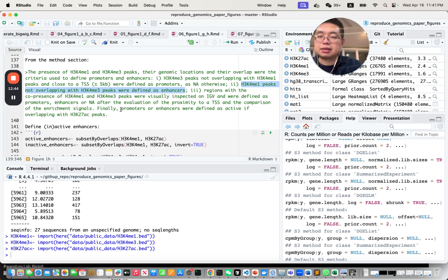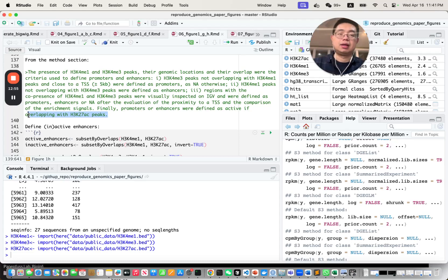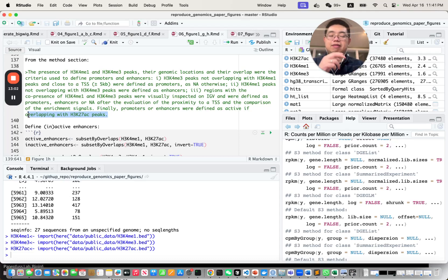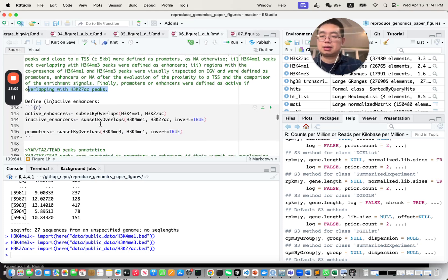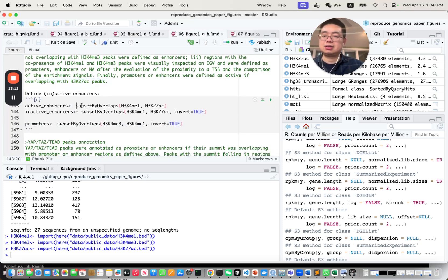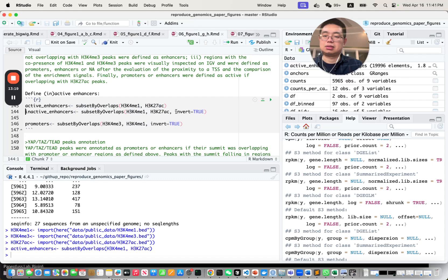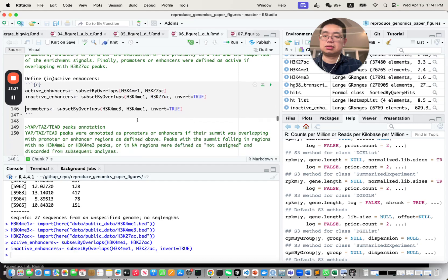If it's H3K4 monomethylation not overlapping with H3K4 trimethylation, those are defined as enhancers. Promoters or enhancers are defined as active if they overlap with H3K27 acetylation. So H3K27 acetylation plus H3K4 trimethylation = active promoters, and H3K4 monomethylation plus H3K27 acetylation = active enhancers.